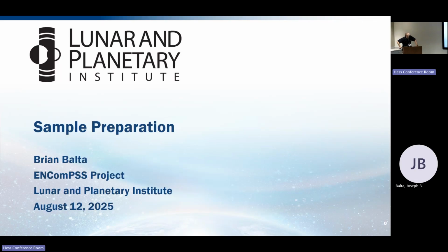Okay, so the two sections that we're going to be doing, one is sample prep and the other is just getting to know the SEM. Serena is doing the other group there, which means you folks get to hang out with me, and we're going to go through as many versions of how to think through sample preparation for an SEM as I can. We will go through some of the basics.